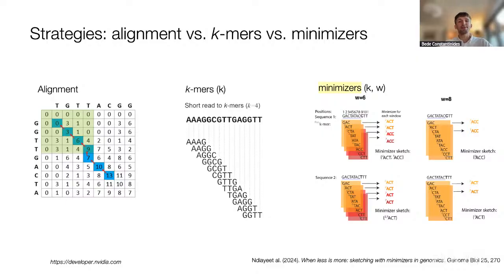Alignment-based approaches can involve either selectively retaining sequences or selectively removing them. An example of selectively retaining them in this manner is a tool called Read It and Keep, developed by Martin Hunt at the European Bioinformatics Institute. But this kind of approach obviously only really works if you know what you're sequencing and you know what you want to keep. So it's not well suited to agnostic metagenomics where you could sequence anything.